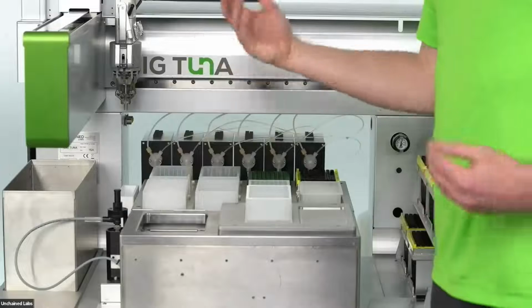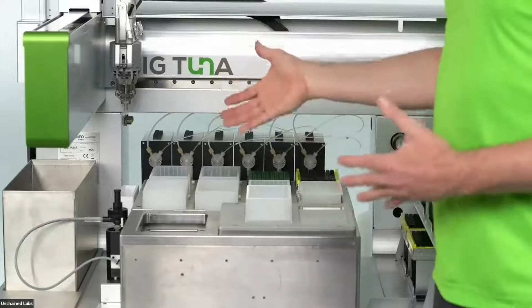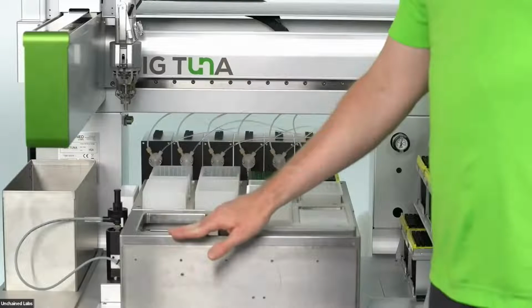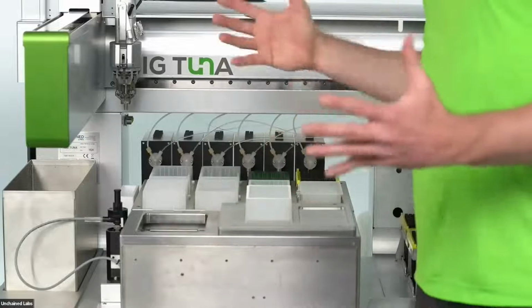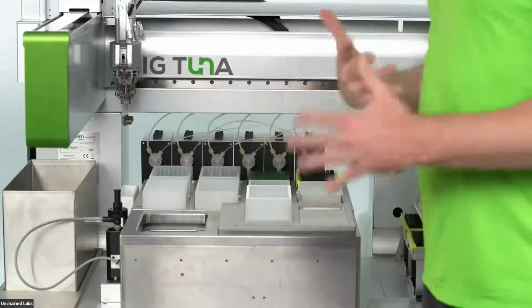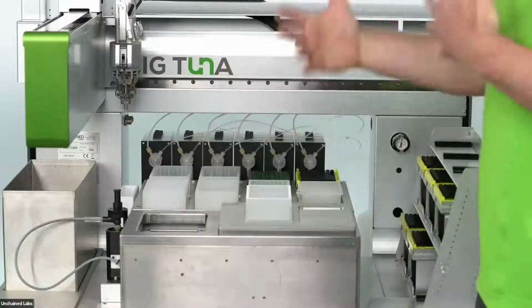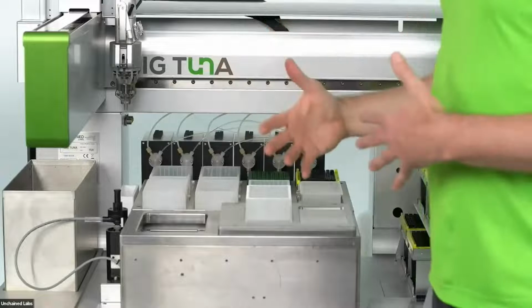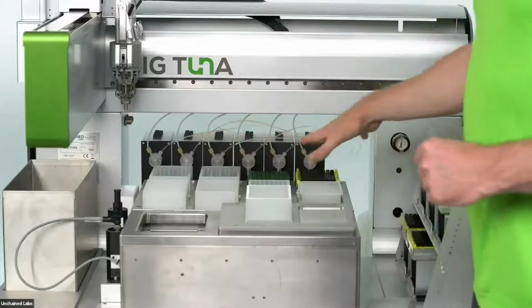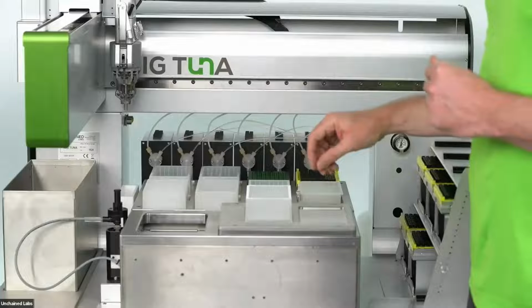That's really cool because now Big Tuna and Unagi both know how to modulate the amount of time that pressure is applied. And the pressure that we apply is at 15, 30, or 60 psi, so more pressure usually means more force, and that can control how fast your exchange or your sample concentration will happen. I'll show you in the software part some of the other features that go into that to drive your overall buffer exchange process. Then there are up to 8 different reservoirs here. We have a nice little showcase giving you an idea of how many of those you have.